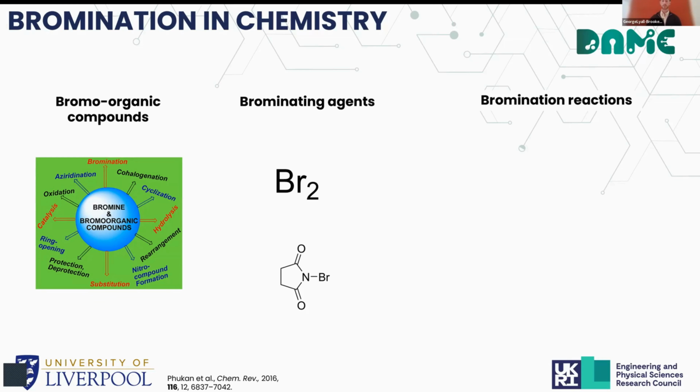The most popular reactions can be categorized into two categories. First, benzylic bromination, which is typically achieved with NBS and proceeds via a radical pathway. This was traditionally done with radical initiators. However, again, there were safety concerns there. So in recent times, benzylic bromination is primarily conducted via UV activation and photochemistry.